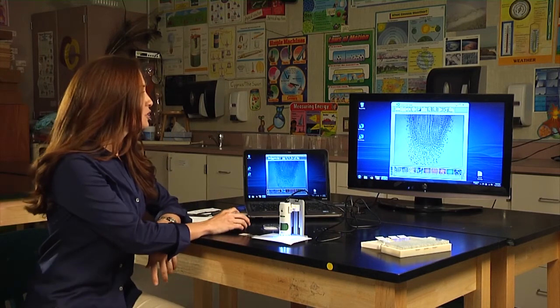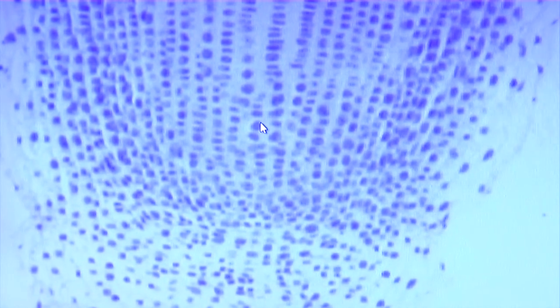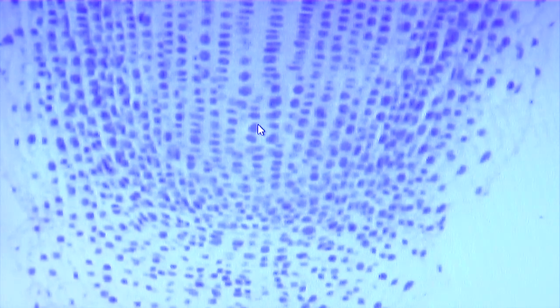First, let's take a look at onion root mitosis. To view the image in full screen, just double click and here you can view the various stages of mitosis.